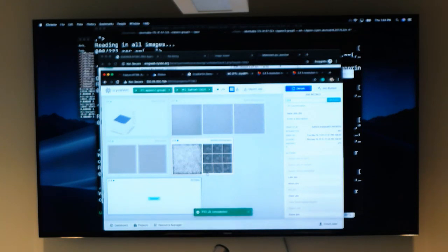So what do you do? Well, back in the day, some people actually looked to make sure that the fits are reasonable, or if there's a big mismatch. But these days we statistically just brute force through it, hoping that we collect enough data that more or less it's okay. Very few people do multiple runs or refine it down. It really depends on the data.